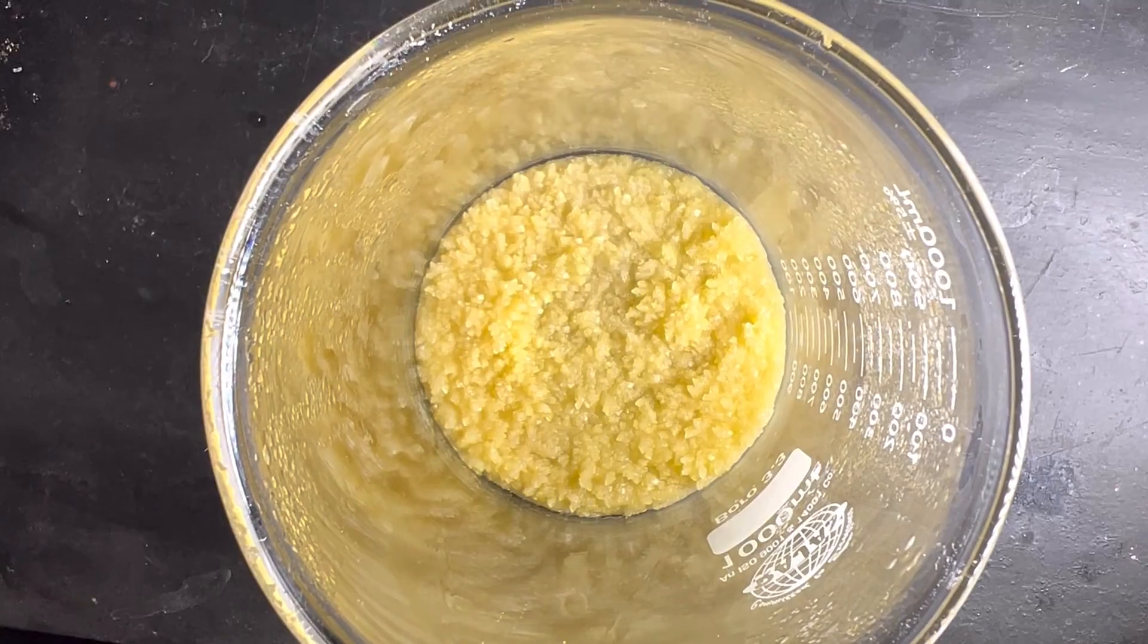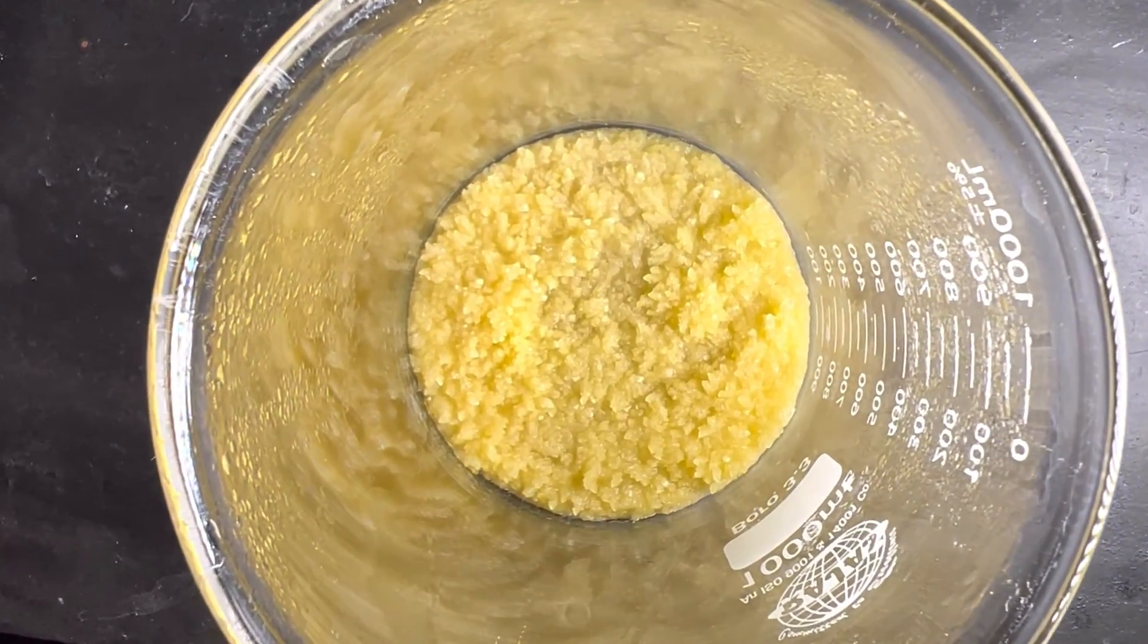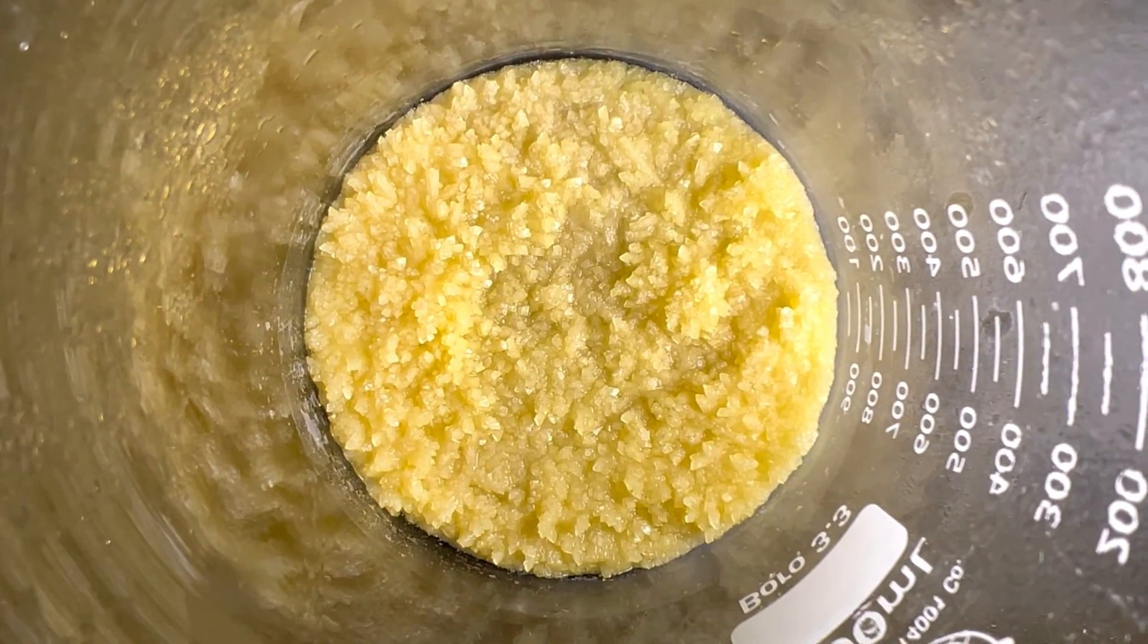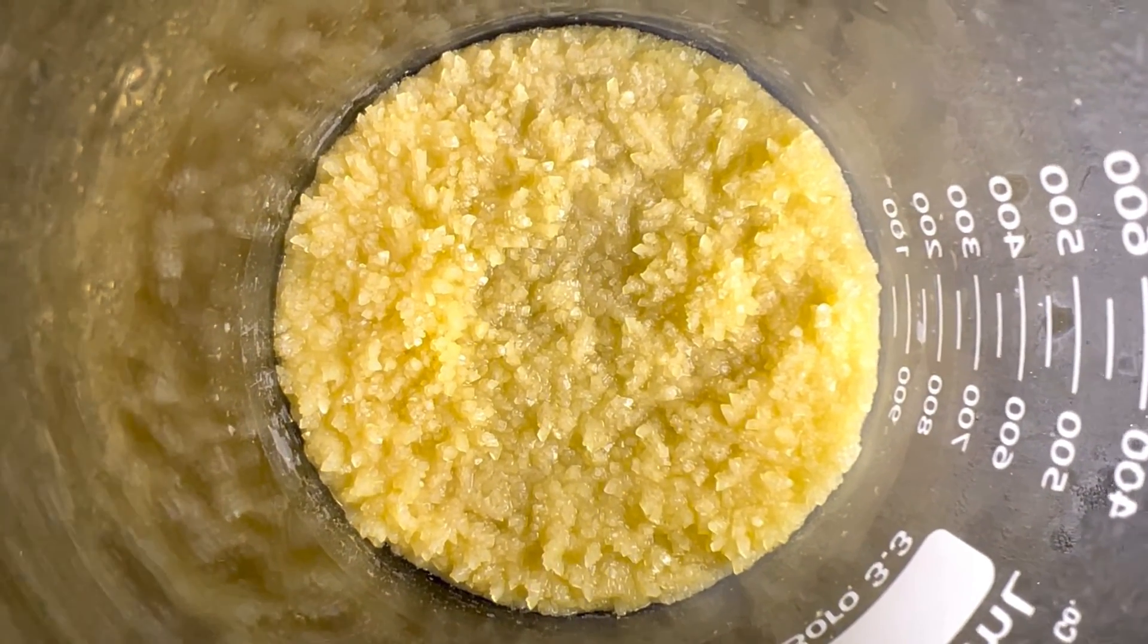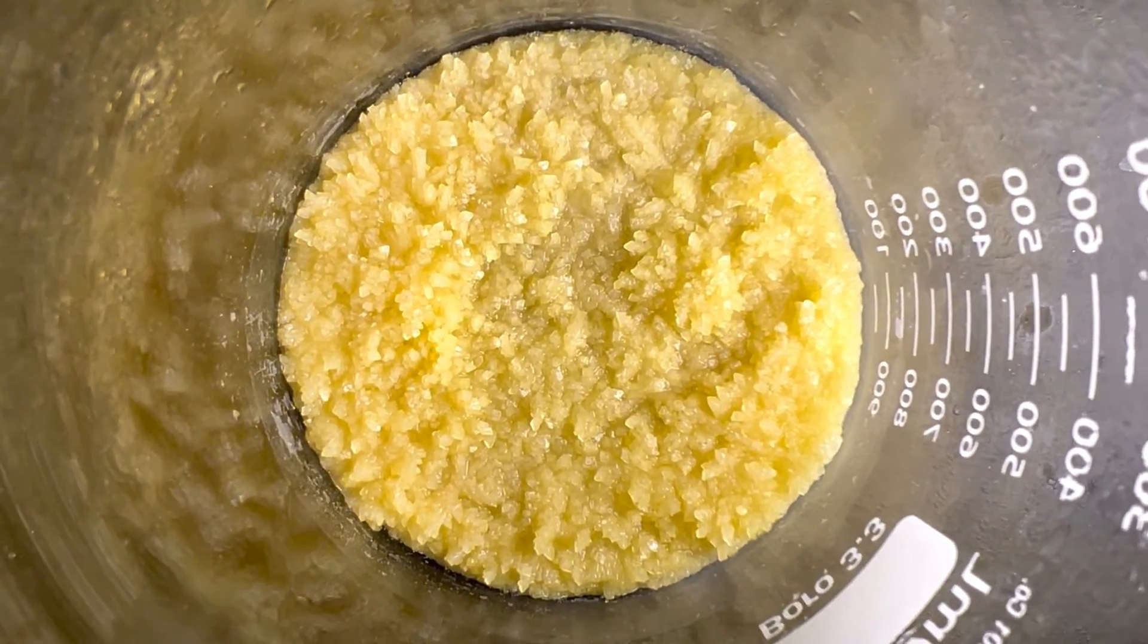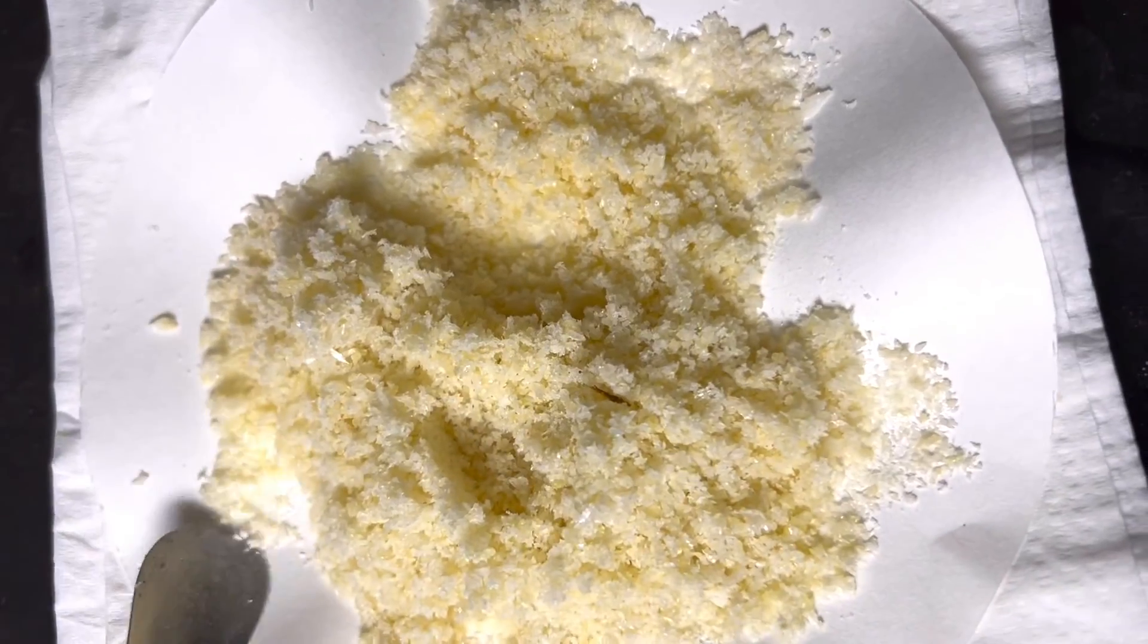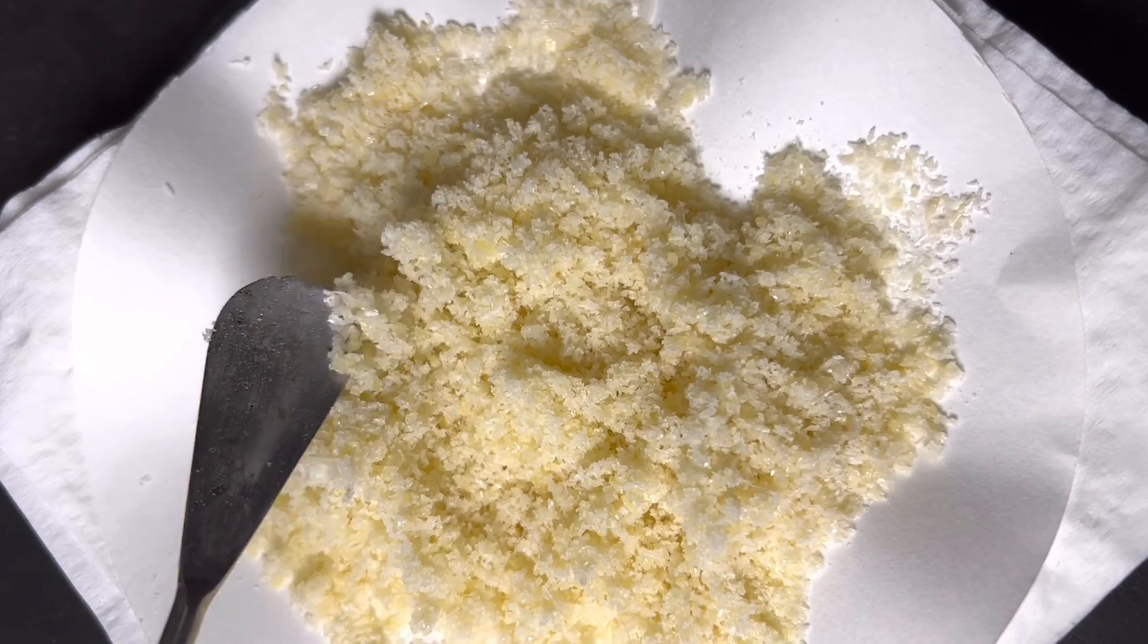Now we move on to recrystallization. It was recrystallized using hot boiling ethanol-water mixture in a 70:30 ratio. Activated charcoal was added to decolorize the compound as it had a yellow color. The mixture was filtered while hot, and on cooling, crystals of barbituric acid separated out. After cooling to room temperature, the beaker was placed in a refrigerator overnight. The next day we saw lots of crystals inside. The color of the product improved significantly and was much whiter. The product was then dried.